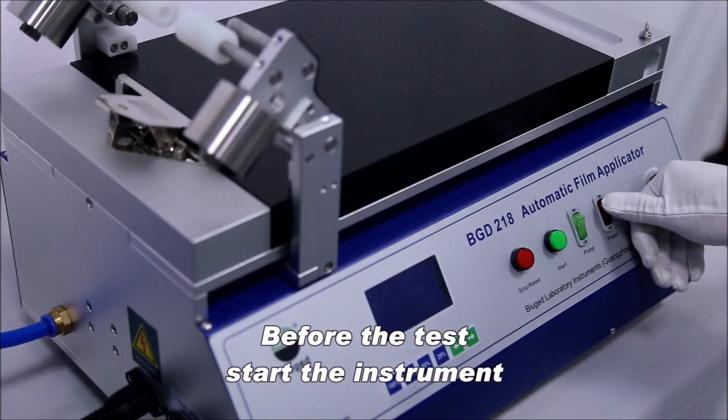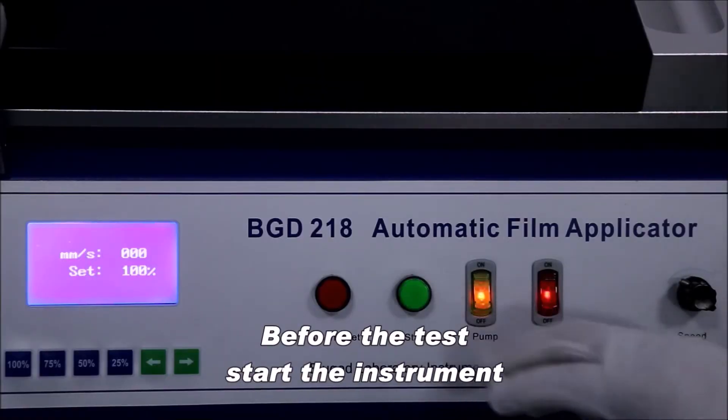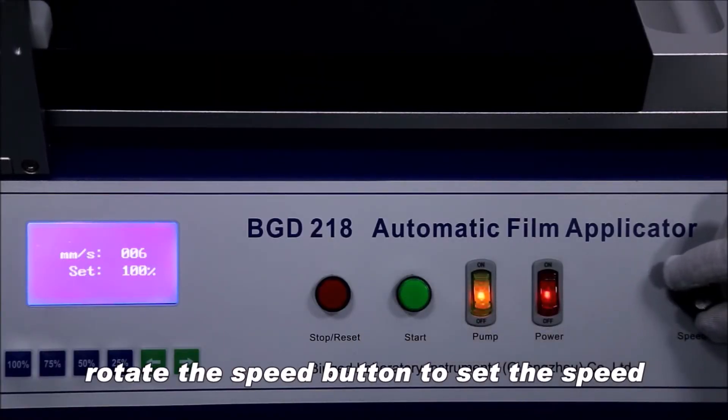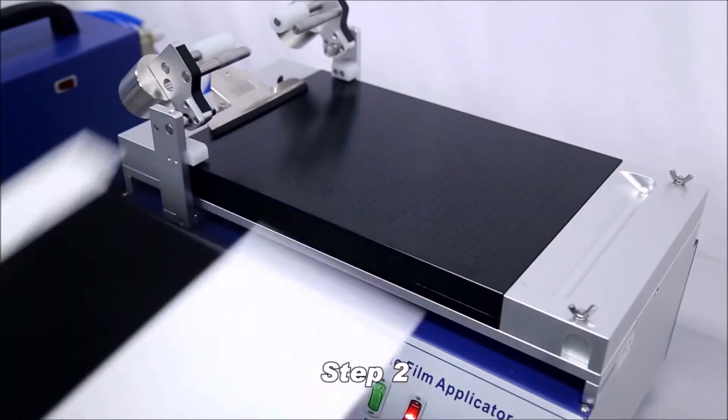Operation. Step 1: Before the test, start the instrument. Rotate the speed button to set the speed. The general speed is 8-10 mm per second.